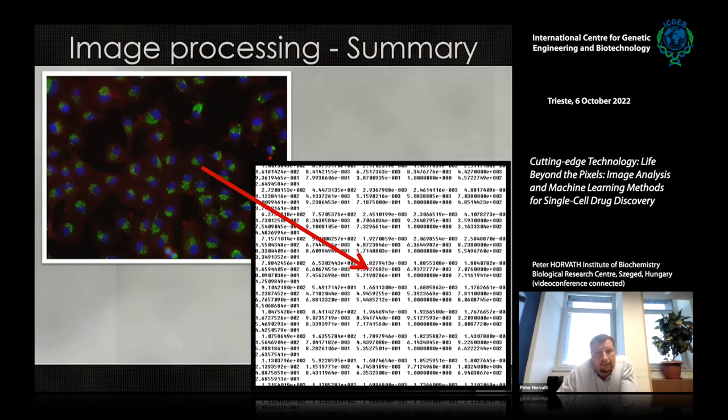This is what we wanted from image analysis, that we turn an image into something quantitative. Of course, my pathologist and biologist in the group would not be very happy if I give 10 billion times 200 matrices and say this is the result for your experiment. So we need to probably post-process it a bit. But let's say at first this is image processing.